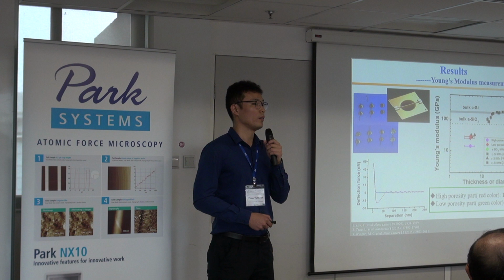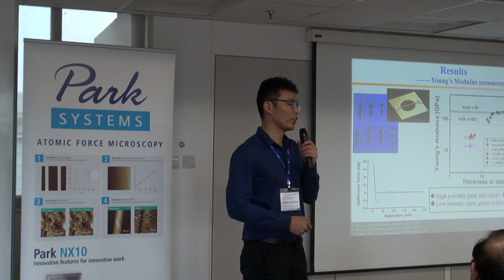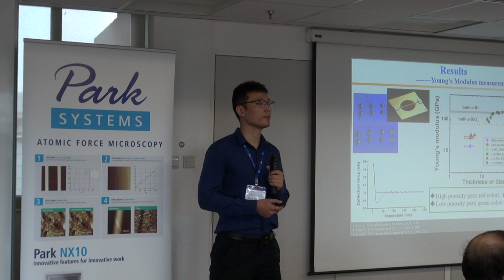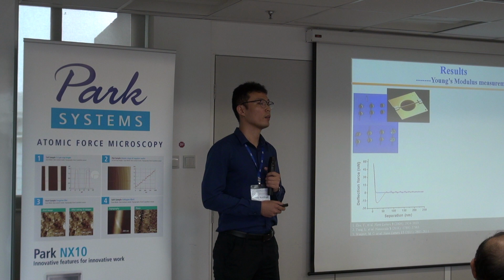So sorry, it will be more towards the material property. Yes. I believe this is done by AFM. Yeah, AFM. And you indent it with a process, so it's been done on the cross section.